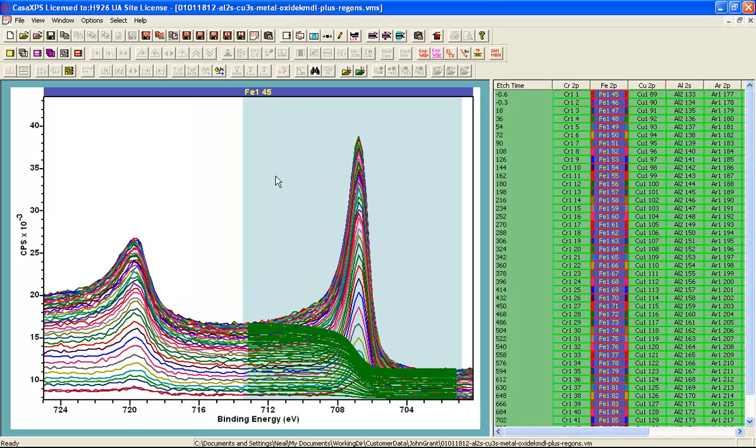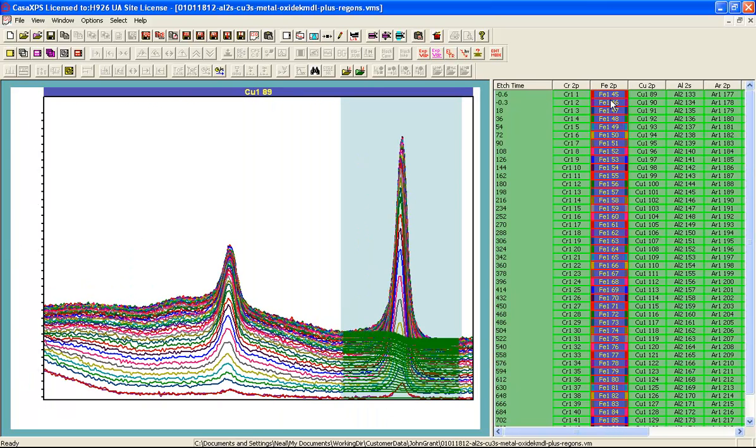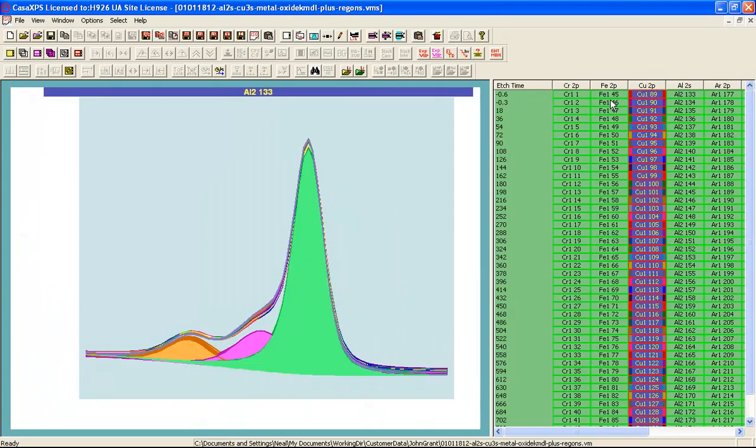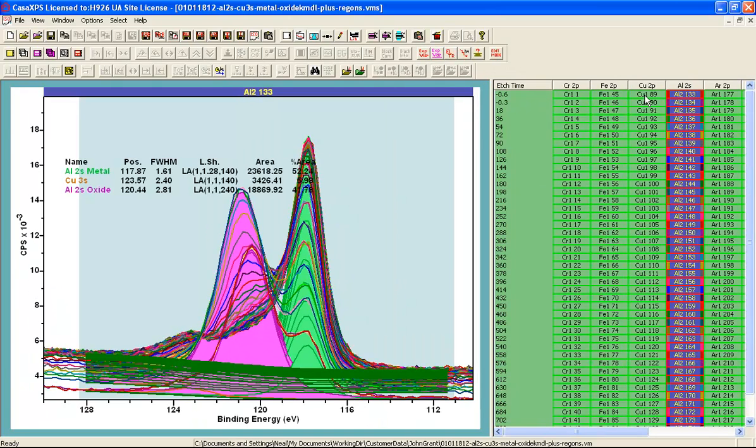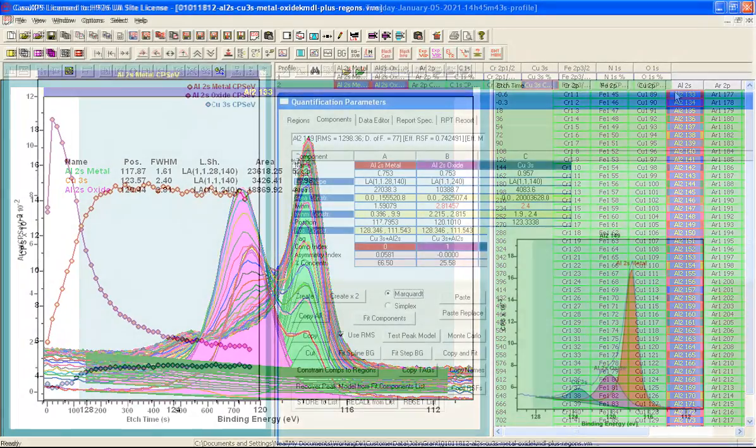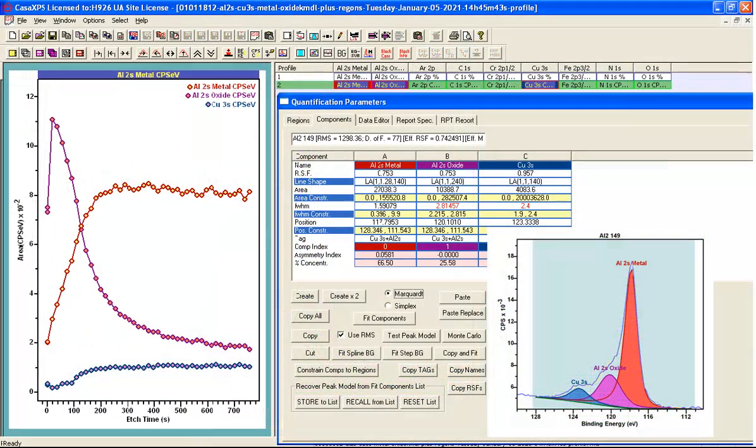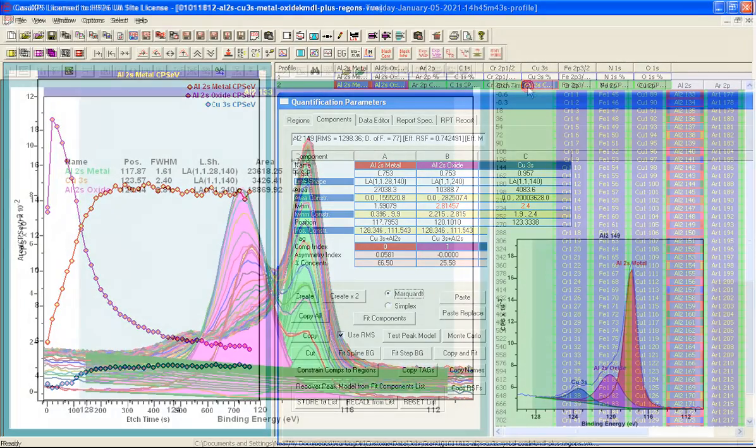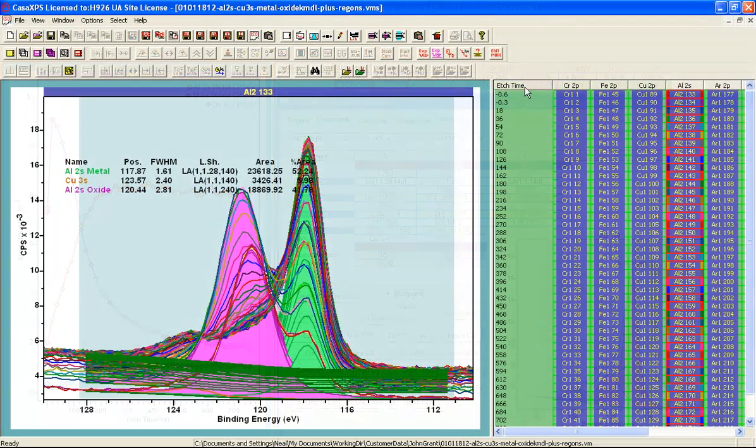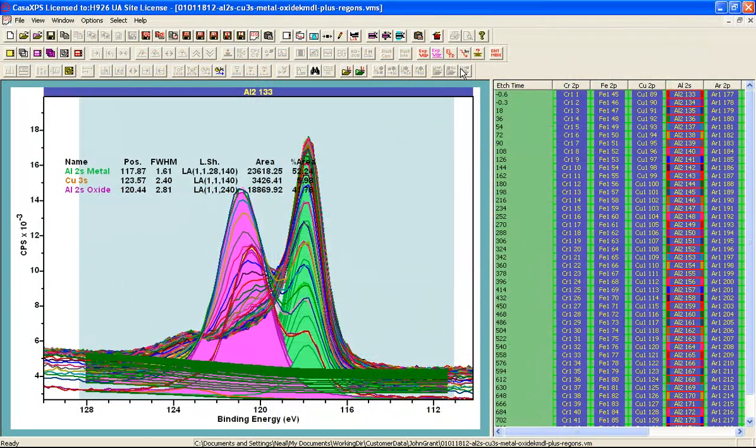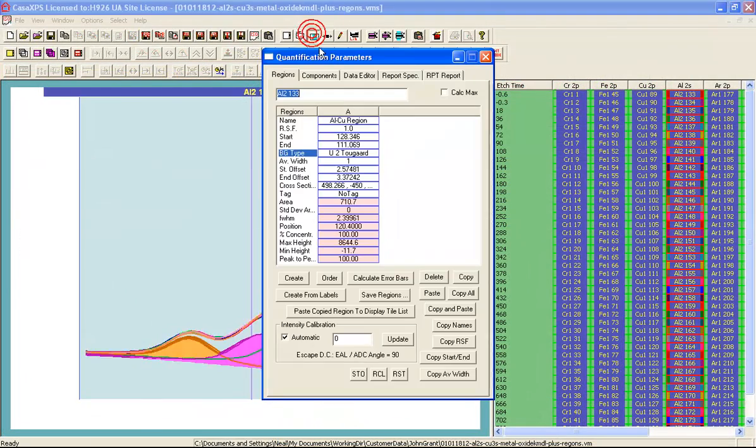Similarly each one of these columns is prepared with a region or in the case of the aluminium 2s there are regions and components and the idea is that these will all contribute to the depth profile.